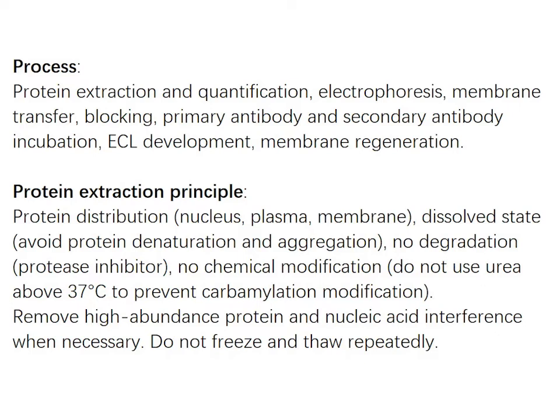These are the principles of the protein extraction. Use the lysis buffer according to the protein distribution. Remain the dissolved state of the protein. Use the protease inhibitor and phosphatase inhibitors without inducing chemical modification. Sometimes you can remove high abundance protein and nucleic acid interference when necessary. Remember, do not freeze and thaw repeatedly.